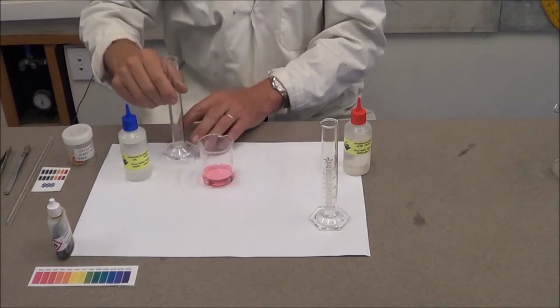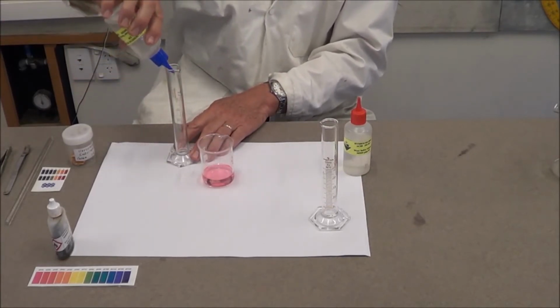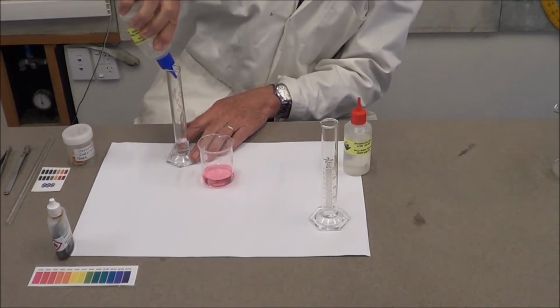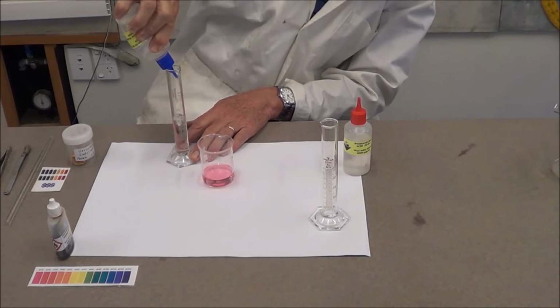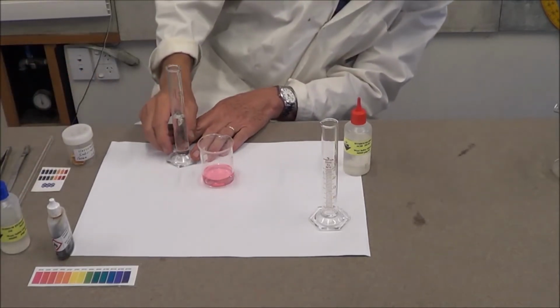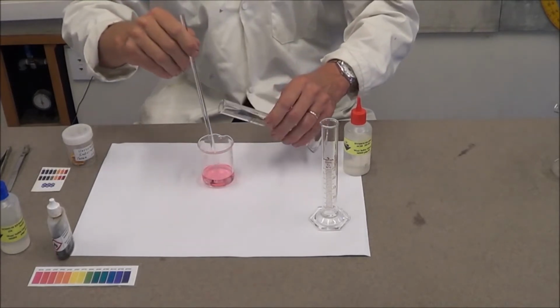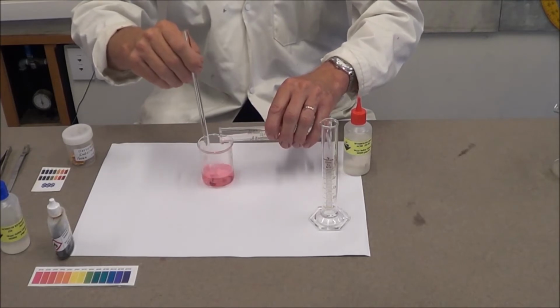We start our neutralization by adding most of the required sodium hydroxide, so I'm going to add 18 ml, ensuring that the meniscus sits on the 18 ml line at eye level. Add the sodium hydroxide gradually and note any colour changes that occur.